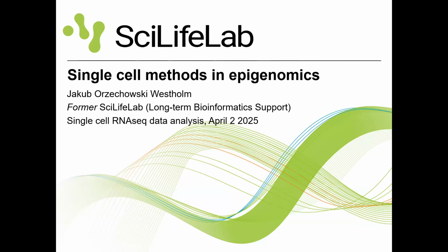Yeah, it's a good question. I know that for ChIP-seq, people have been using, for example, input DNA, but for single cell, I'm not 100% sure, but I think you just use the regions around that you identify as low signal regions. I was thinking that as well, maybe it could be the same sample, a global distribution and then averaged.